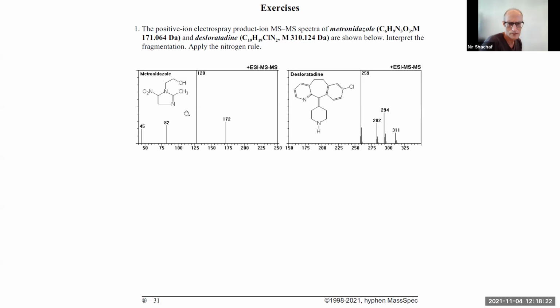So that, I guess, most reasonably corresponds with the loss of NO2 from the ring, but that means that 82 needs to be an odd electron, so radical. The loss of NO2 is always the loss of NO2 dot. So you lose a radical. Okay. So the 82 is indeed after the loss of NO2 dot from the 128.